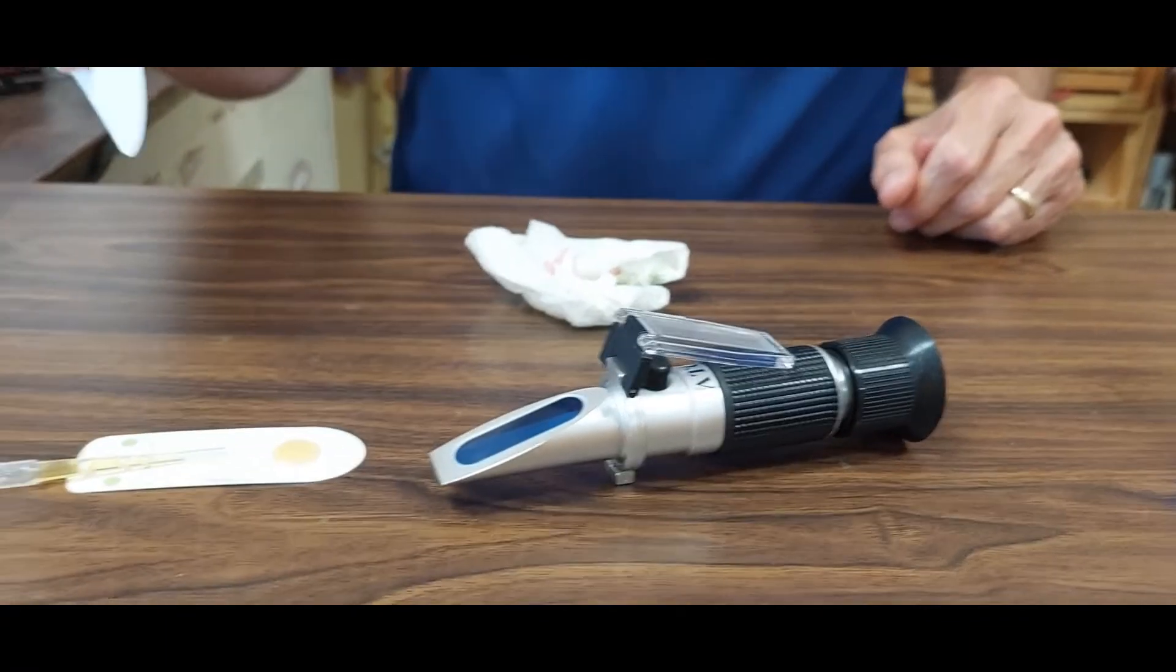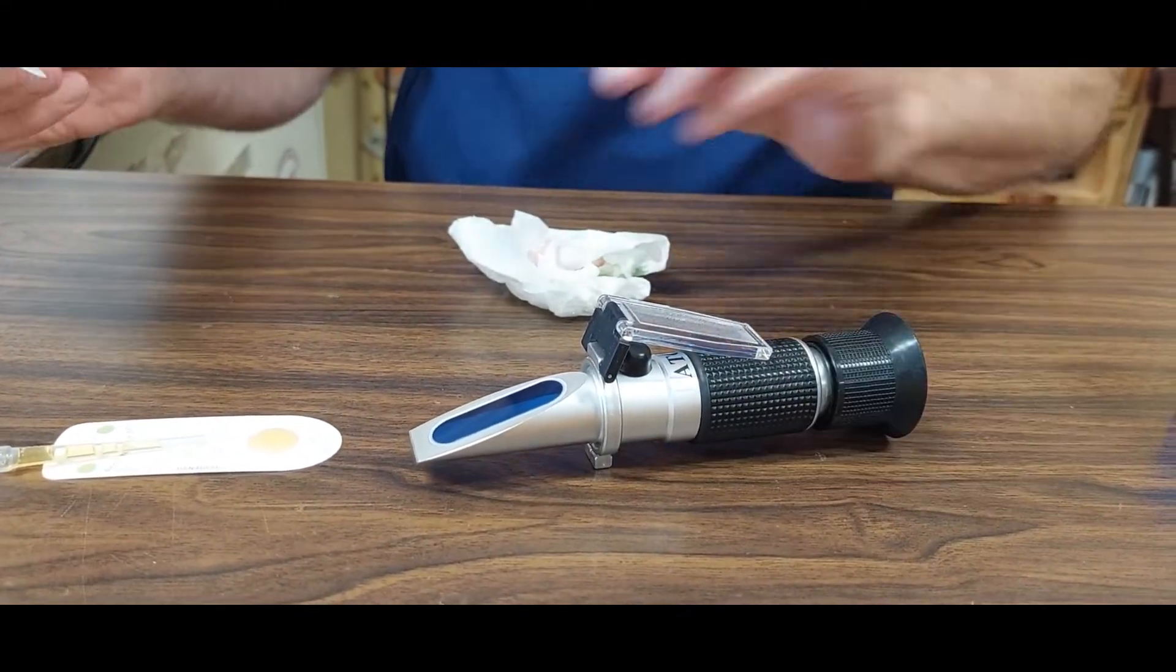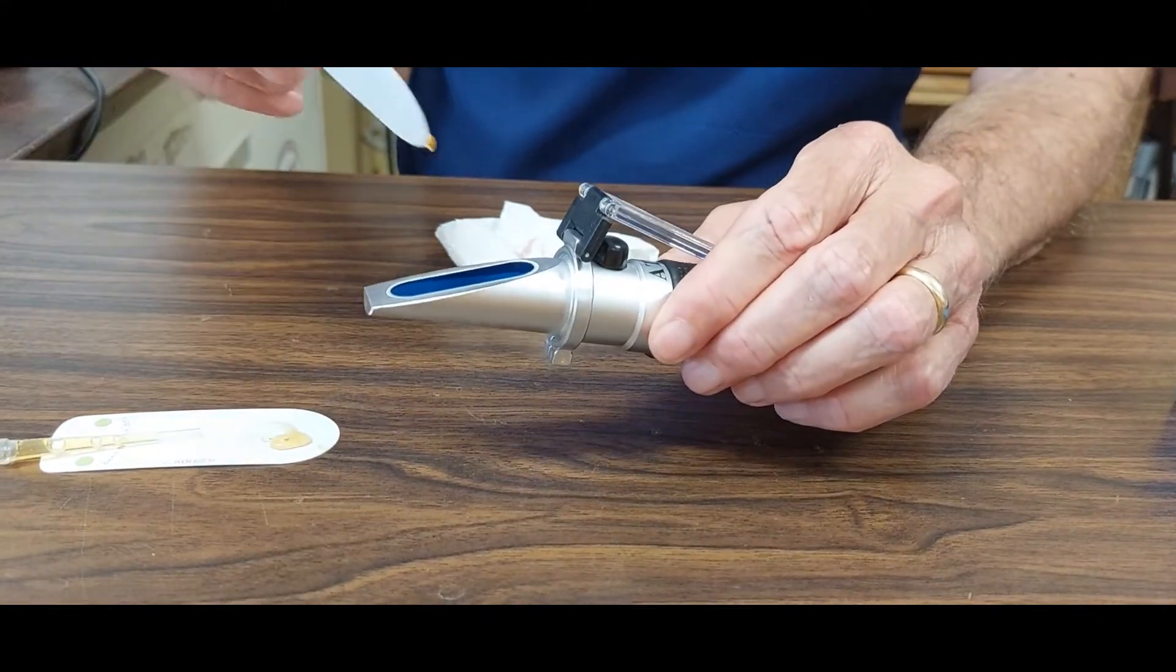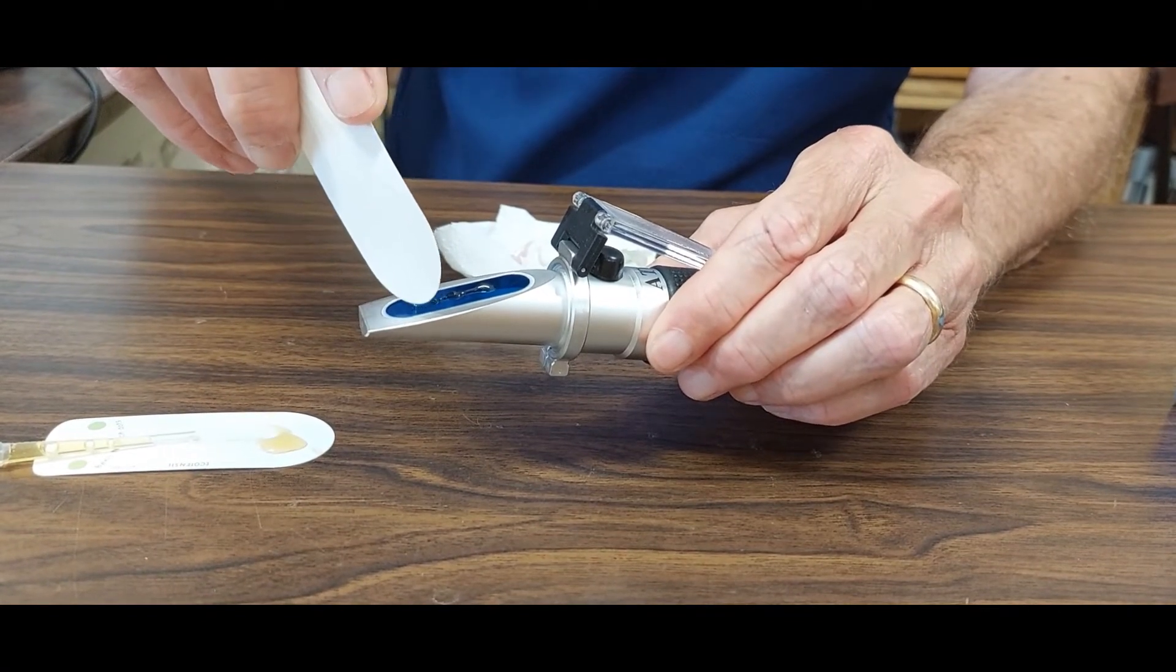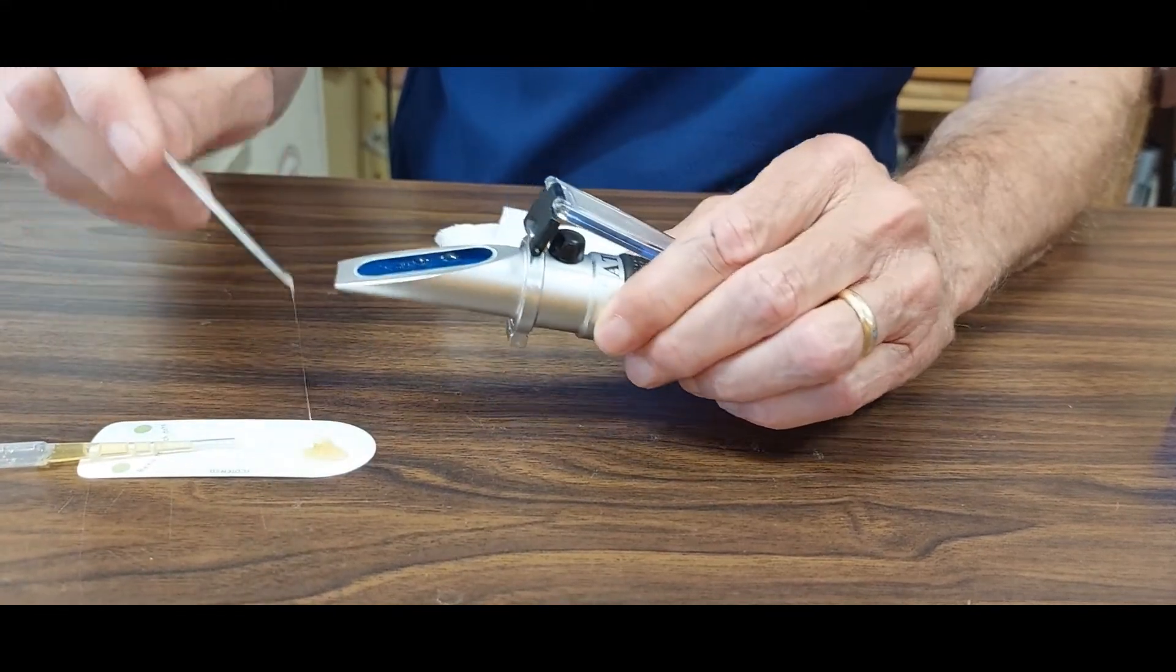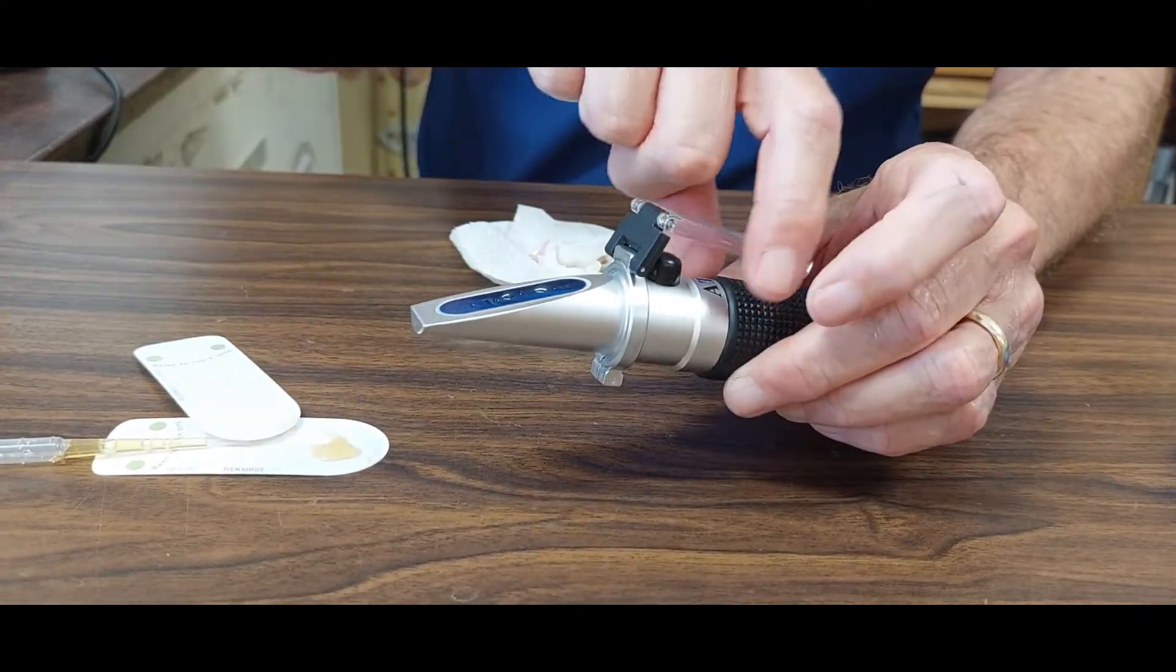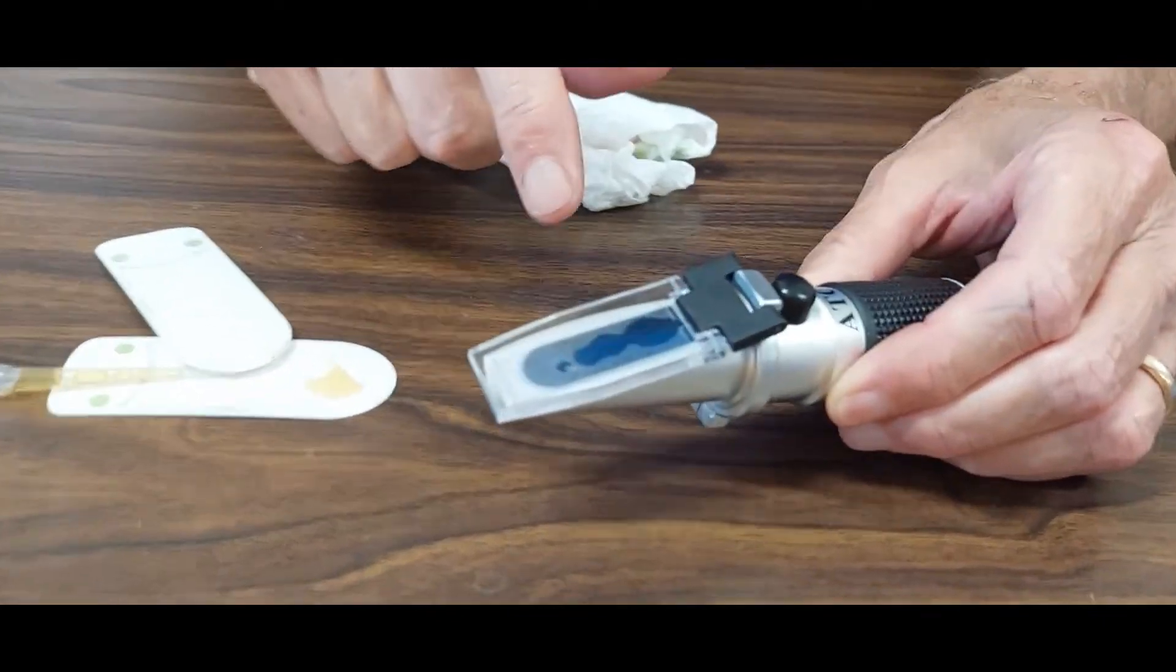Since the pipette did not work too well on getting the honey onto the refractometer, I'm going to try plan B, and that's just to take some honey up here, and just dab it. And it really doesn't take as much as you would think. This may be enough right there, and I'll see when I close it up.